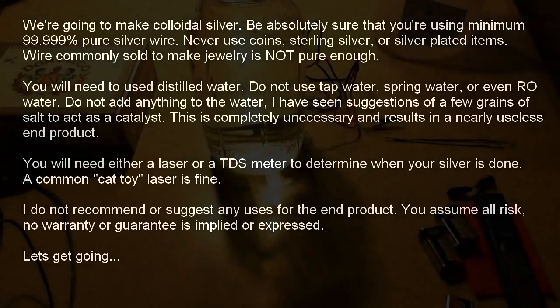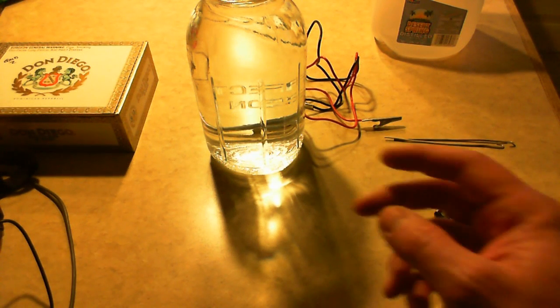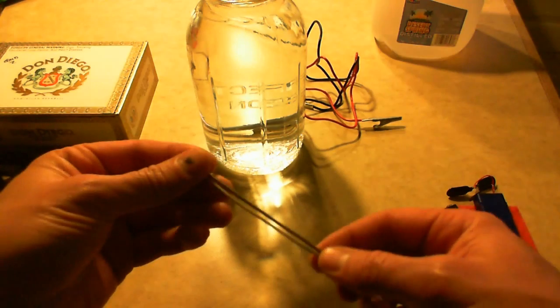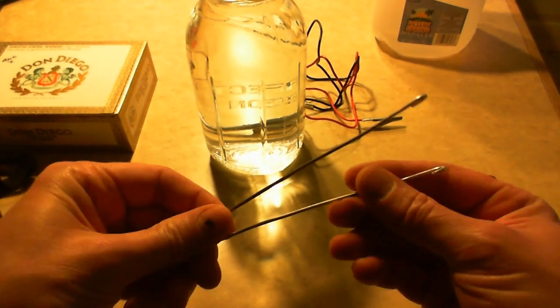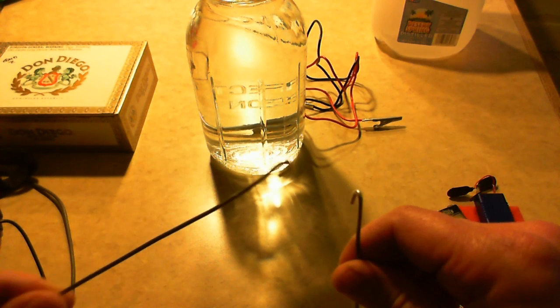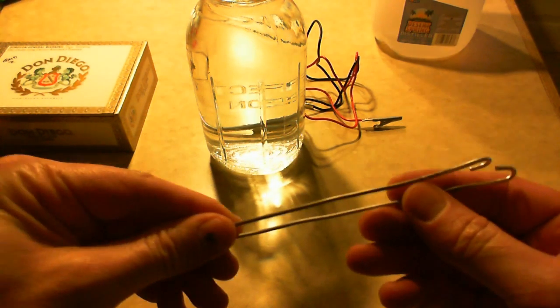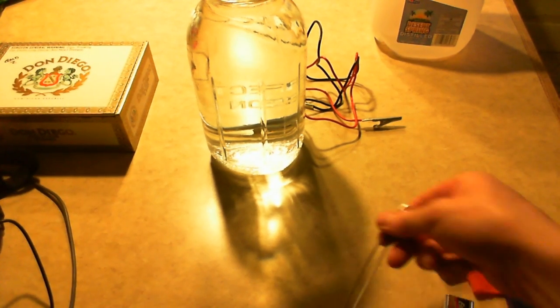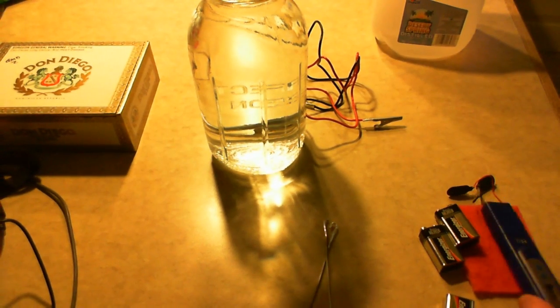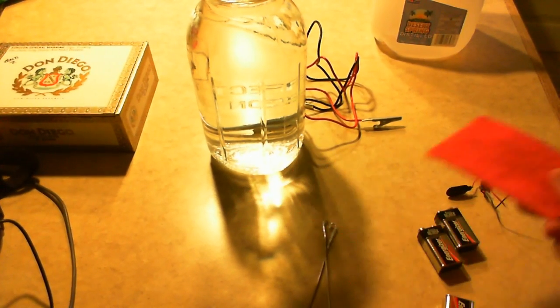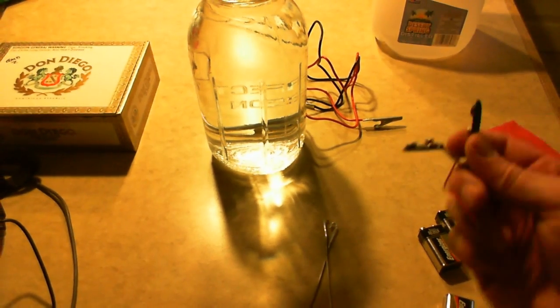Okay, let's get started with some of the other stuff you'll need. Here, of course, your silver wire cut the length depends on the kind of container you use. The depth - I might bend a little hook on the end of each one so they go over the edge of the container. You'll need a scrubby like a Scotch-Brite pad to polish your silver.